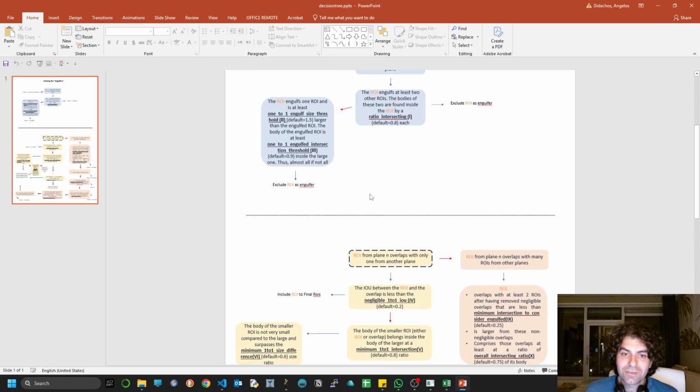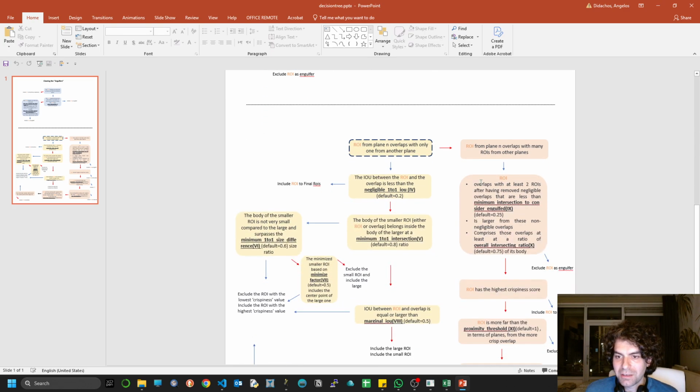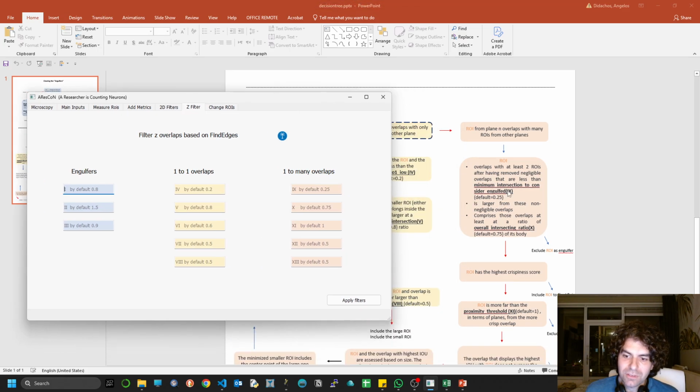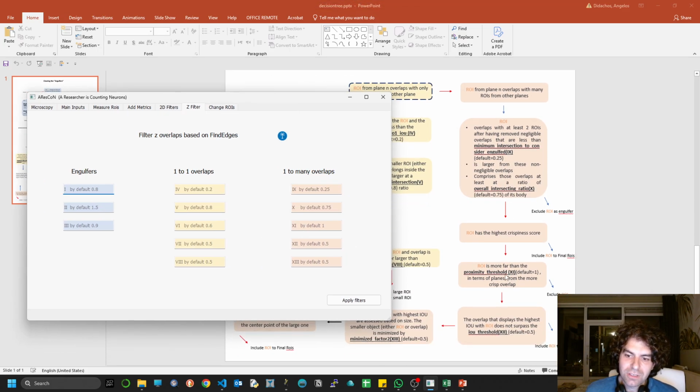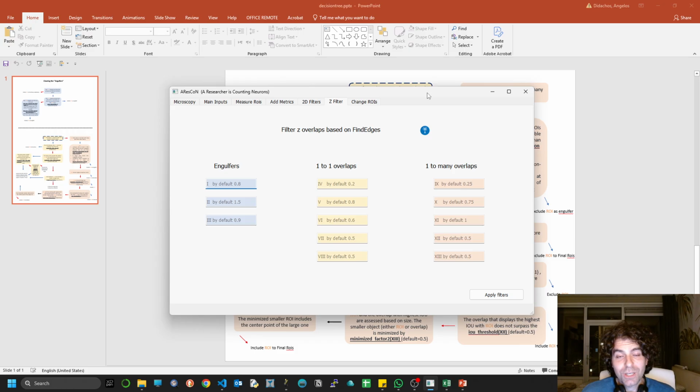And you can see the different colors here, like the cyan, the yellowish, and the sort of beige, I guess. This corresponds to the colors here, and every condition is named in Latin, so you can see what condition corresponds to what and what happens when you change it. I can be more descriptive about that if you ask me. It's quite complicated, so I cannot just remember things by heart. I have to go back to the algorithm that I developed and remember what I did. So my recommendation: just keep it as it is, alright? And let's try to apply filters now and see how it works.